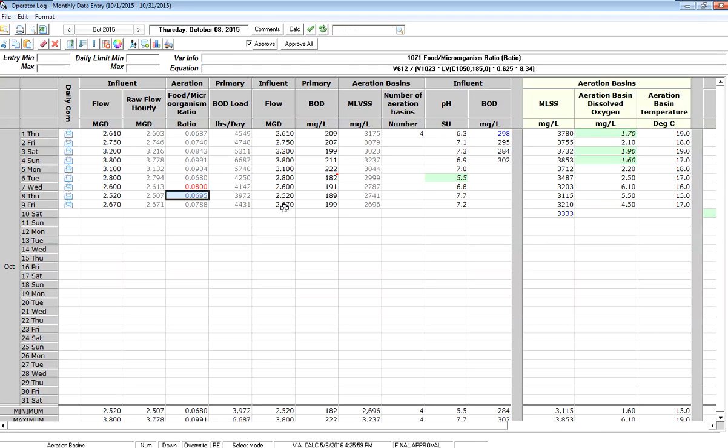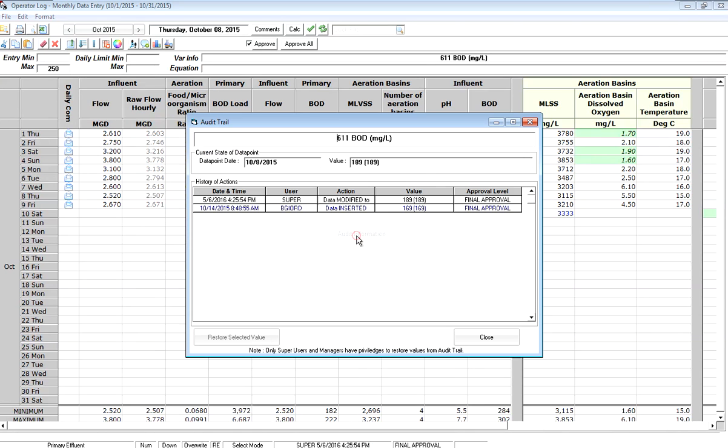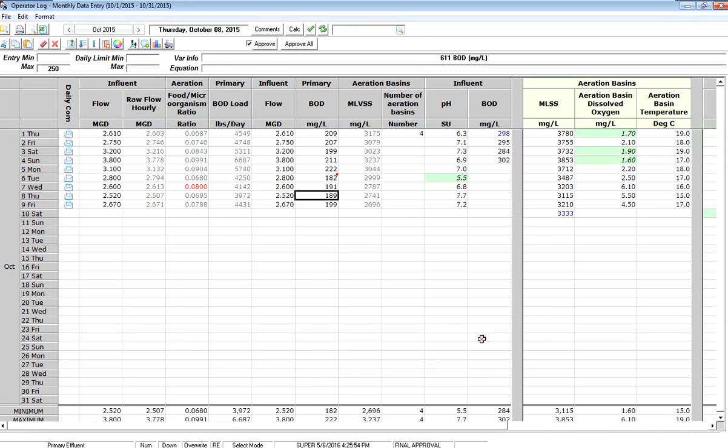I can also click on a cell and say, well, who entered that data? Who edited that data? And who maybe made that data entry error? So we have something called audit information. It keeps the full trail of data and what I see is that Barry entered that 169 and then obviously I, logged in as super, have just edited that data.